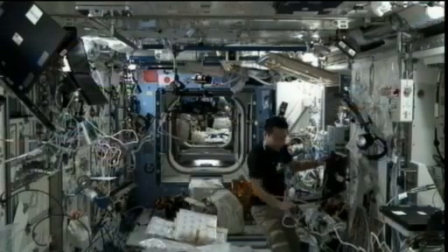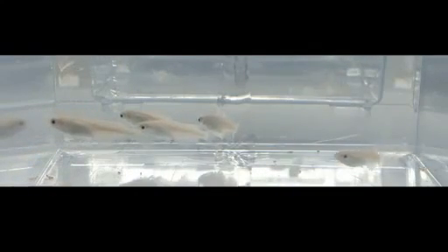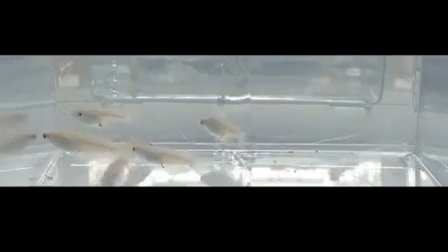The hardware is a system of two aquariums, each about half a liter. The system can support anywhere from 8 to 12 fish, if they're zebrafish or medaka fish. Those are the two types that will be studied here. The system is a lot like what you'd see on the ground in terms of keeping your fish healthy. You've got an environmental control system with a biological filter that filters out the waste. There's an LED lighting control system that gives night and day, light and dark cycles, so the fish have cues, because you don't get that in space station. There are automatic feeders, and there's an oxygenation system that makes sure the fish get the oxygen in the water that they need too.